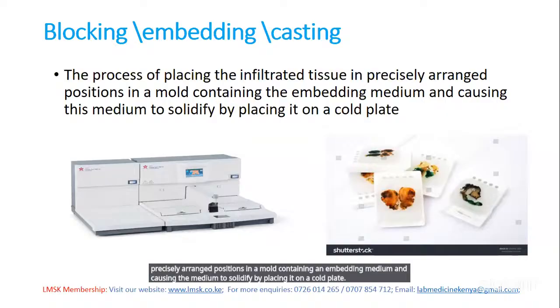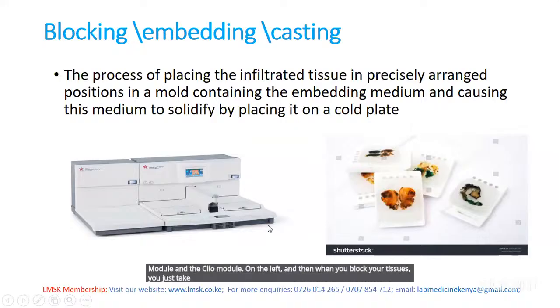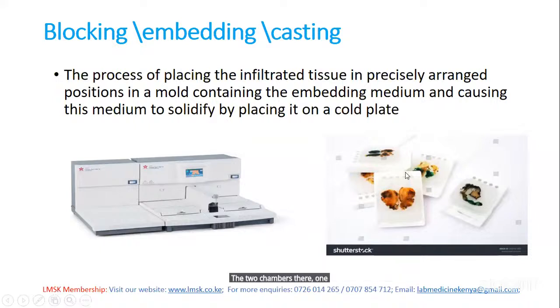You can see our embedding station there. It has the embedding module and the cryo module on the left. And then when you block your tissues, you have molds inside there. The two chambers there, in one you place the tissues, and in the other one you place the molds. Then you take the mold and you add some molten paraffin wax, which is normal in that chamber.